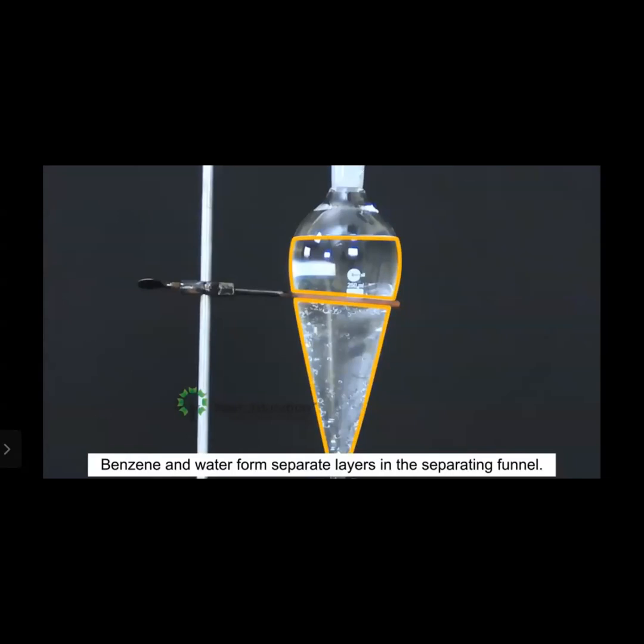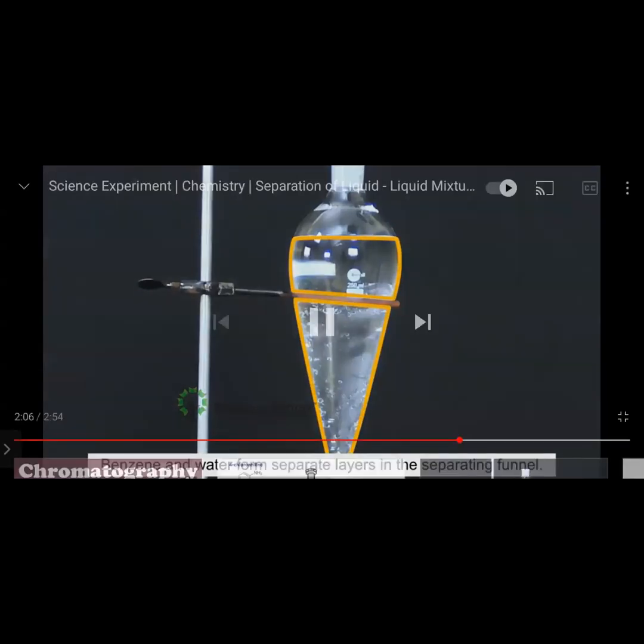I'll just explain to you what I was telling you, right? The benzene and the water, when left to settle, form separate layers. And they just basically show you how to collect each one of them, right? Anybody there has any questions based on that?